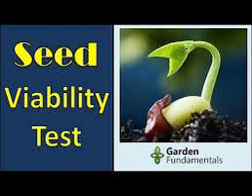After a specified period of time, 5 to 10 days, the paper is removed and 5 seedlings are selected. Then the length, root plus shoot, is measured and the mean seedling length is calculated. A seed lot producing taller seedlings is considered more vigorous than a seed lot producing shorter seedlings. For dry weight determination, the seedlings are removed and dried in a hot air oven at 100 degrees Celsius for 24 hours. The seedling dry weight provides additional information for assessing seed vigor.